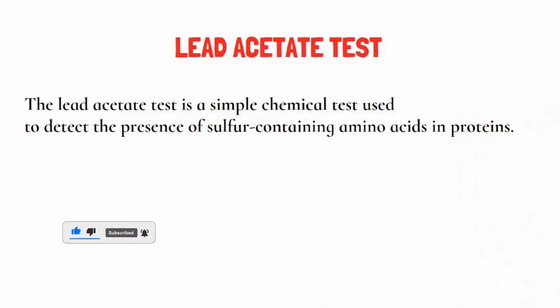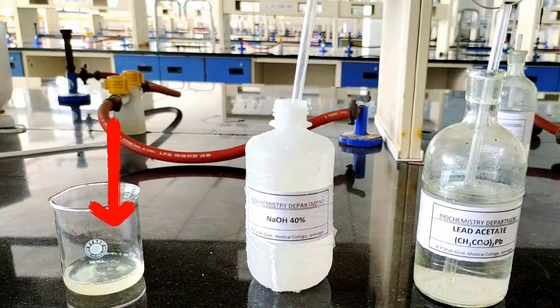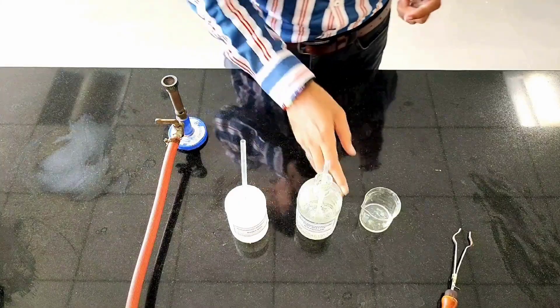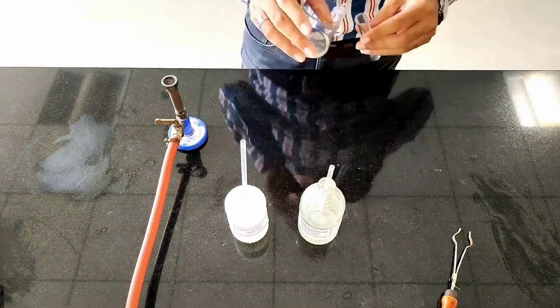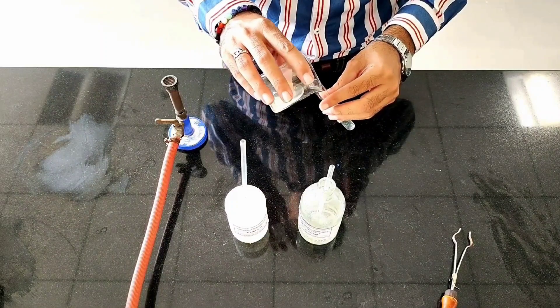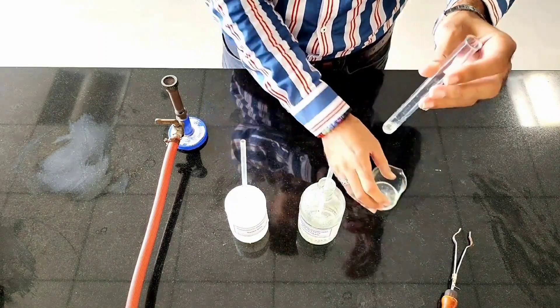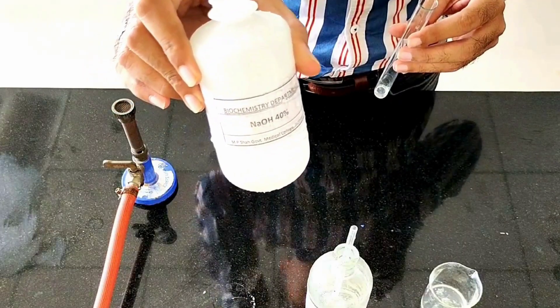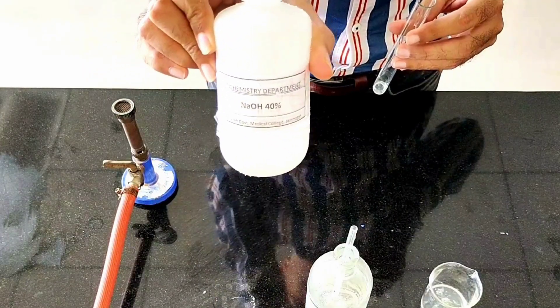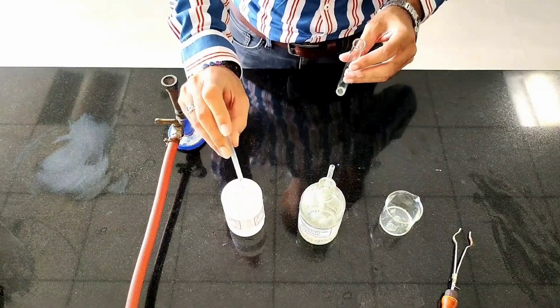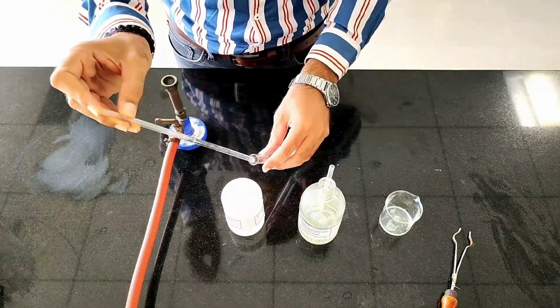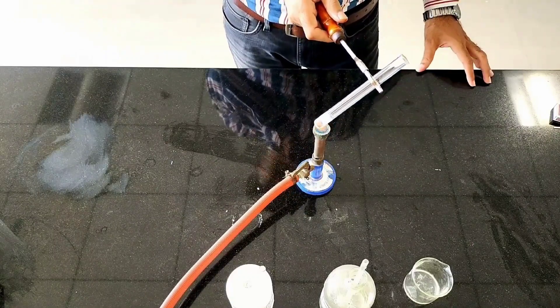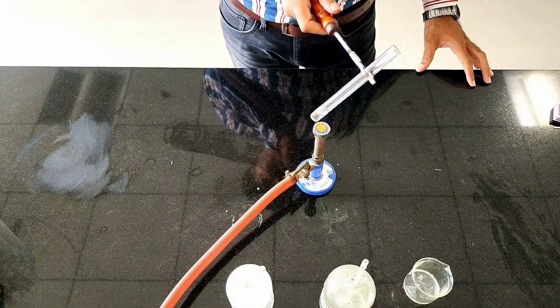For this we require protein solution, 40 percent NaOH, and lead acetate. First we will take one ml of protein solution, then add one ml of 40 percent NaOH. Then we will boil it — this will hydrolyze the protein, meaning breakdown of peptide bonds.